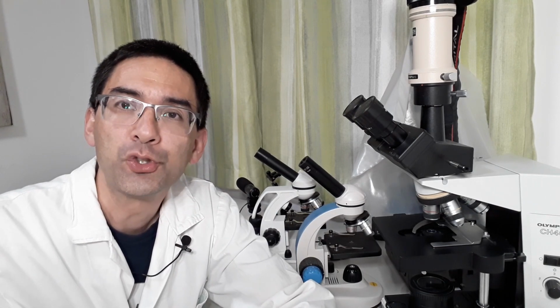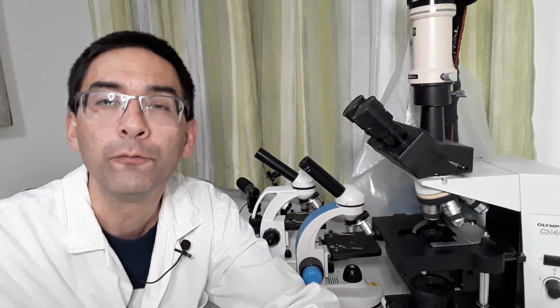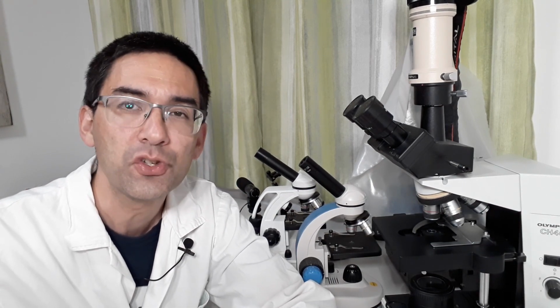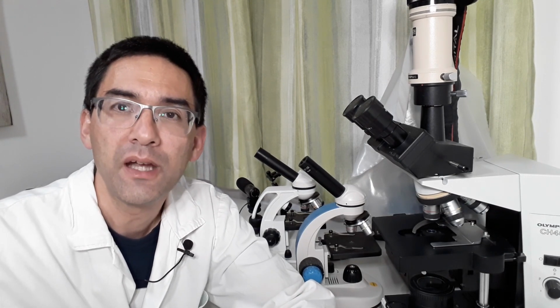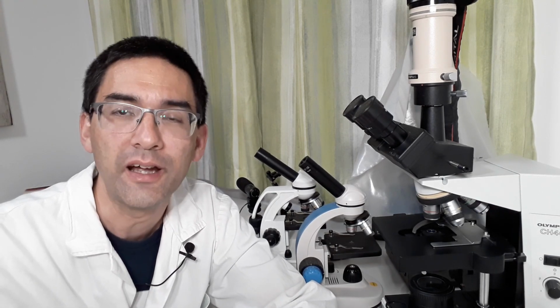But today I'm going to also show you a second advantage, and that is that Köhler illumination is also able to eliminate stray light, and therefore it can slightly increase and improve the contrast under some specimens. Now the effect is not always very strong, but it is a little bit noticeable, so I'm going to show you that. That is basically Köhler, and then I'm going to also talk about the so-called condenser diaphragm.